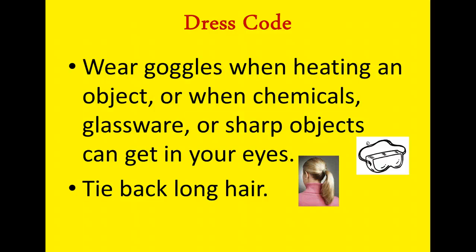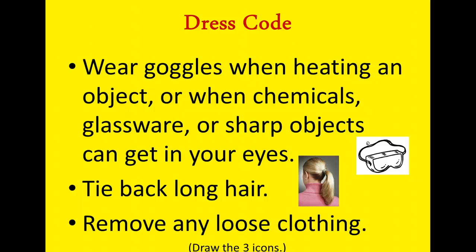Next, if you have long hair, whether you're a girl or a boy, you do need to tie it back. It can be very dangerous to have hair in your face where you won't be able to see, but also if we were ever to use a flame, your hair could catch on fire, which obviously wouldn't be very good. So always tie back your long hair. Remove any loose clothing.